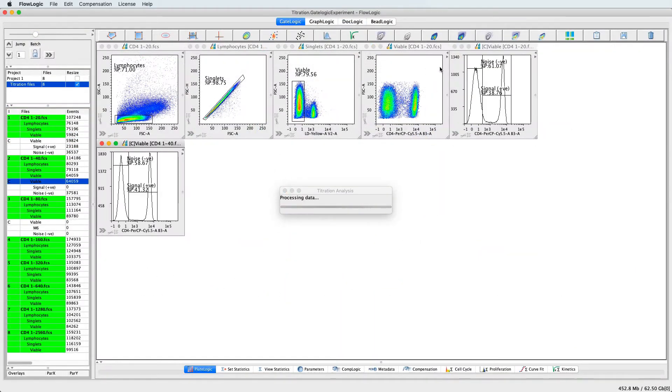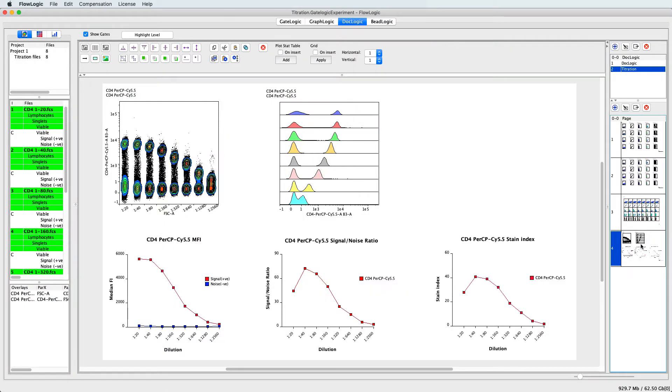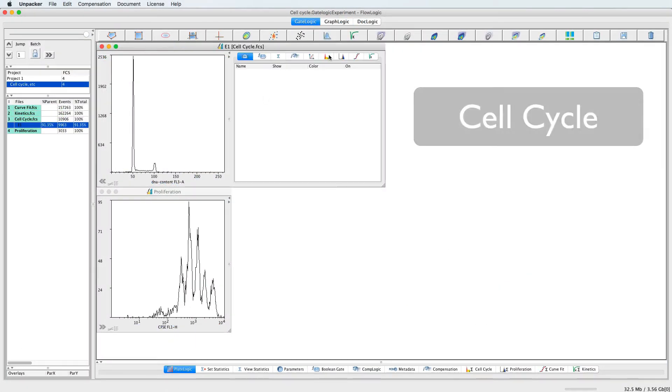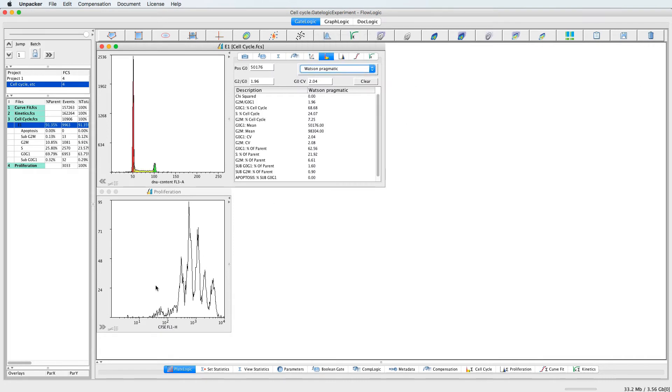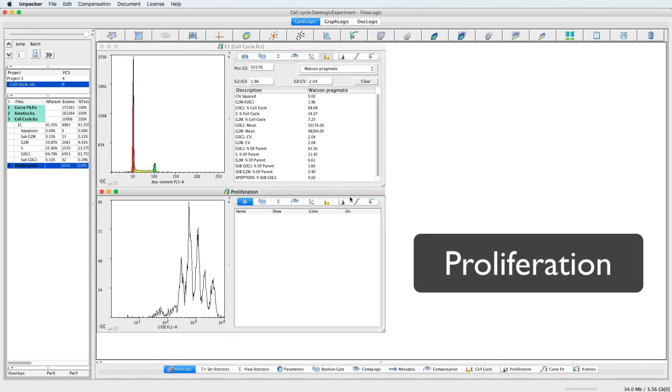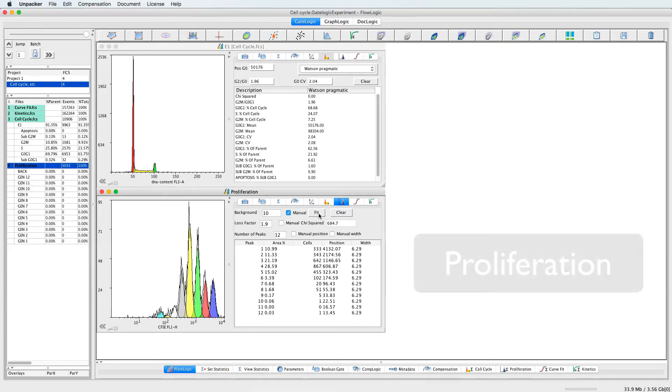use the inbuilt features for auto-titration analysis, index sorting management, high accuracy auto-compensation, or algorithms for cell cycle and proliferation assessment, or multiplex bead-array analysis.